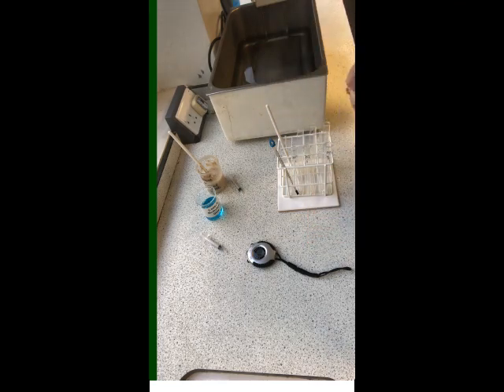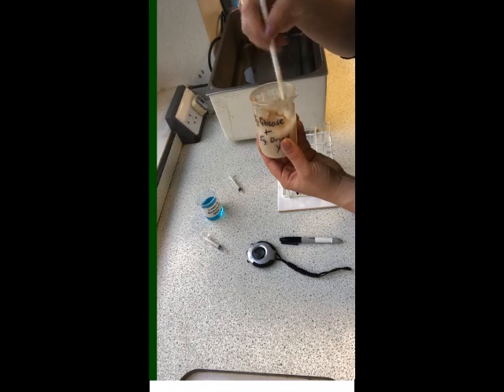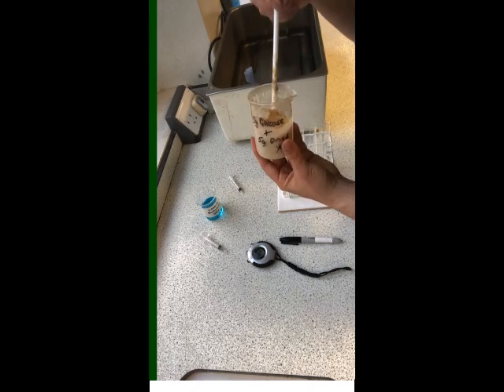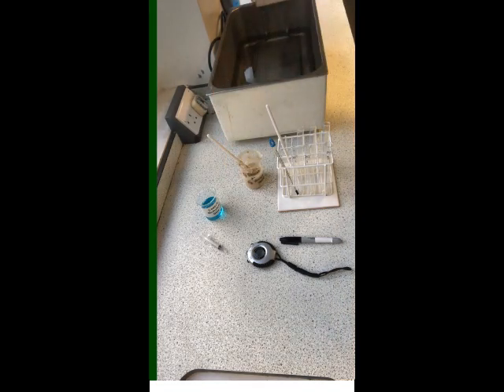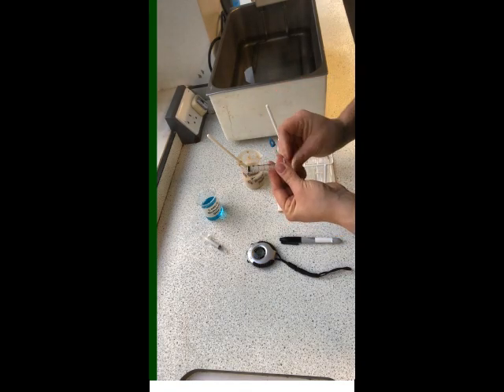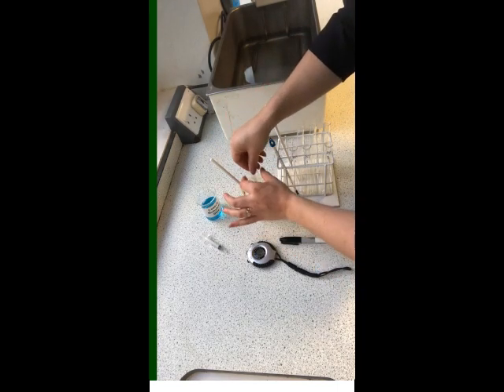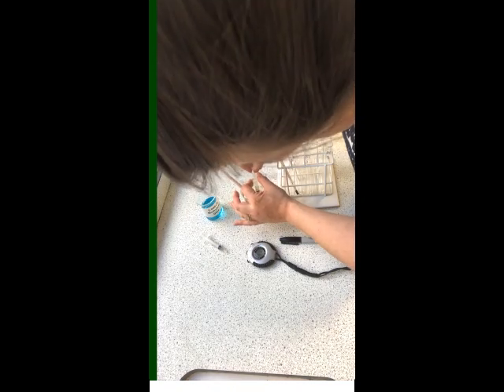Okay, so we will run the first one. So what we're going to do is make sure that this is well mixed so that we've got our yeast evenly distributed throughout the solution, so we don't accidentally take a sample with too few yeast or too many yeast, to keep it nice and fair and controlled. Okay, and we are going to add 2 centimetres cubed of this yeast mixture to our tubes. So we are going to use a syringe for this, because it's the most appropriate equipment we have. And as I say, we've stirred it, so we just need to measure out our 2.